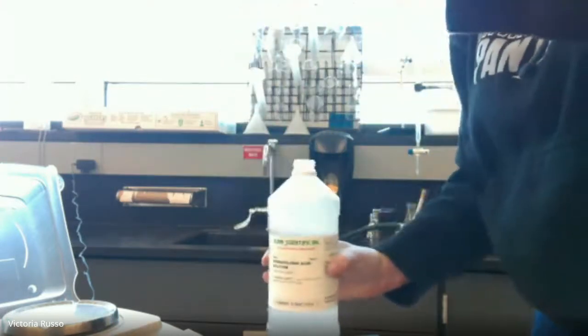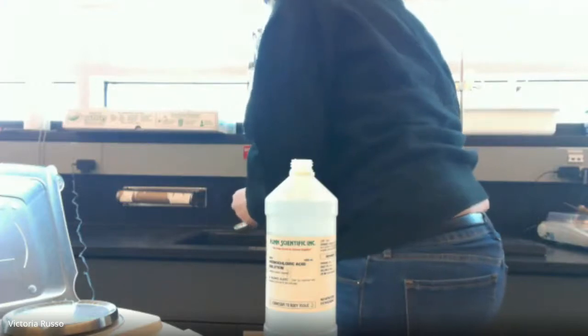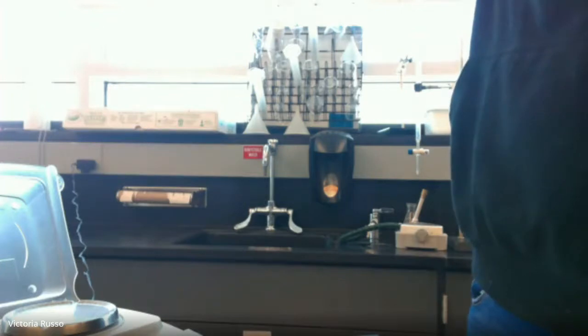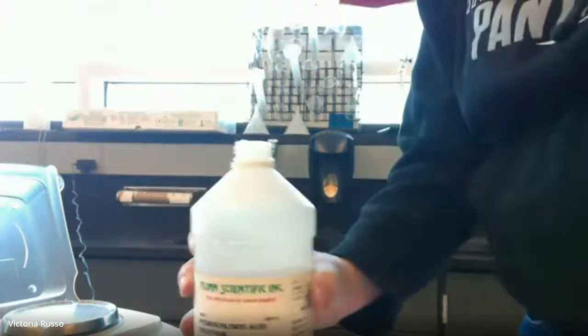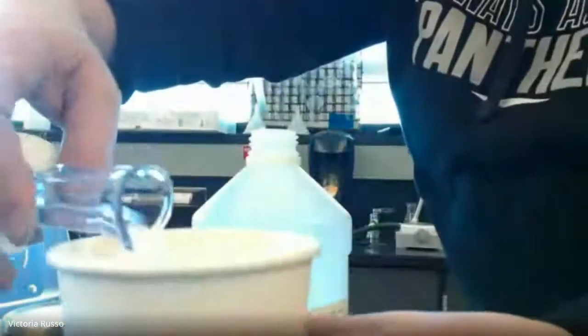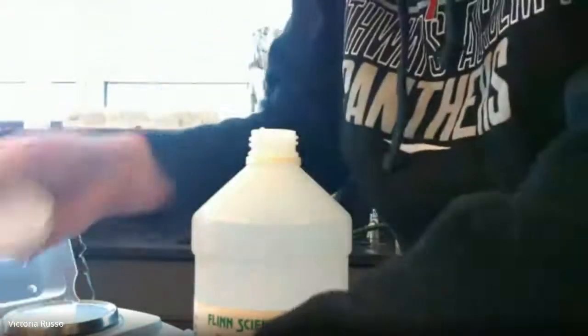I am going to pour the hydrochloric acid, and looking at the meniscus, I'm measuring the acid to the 40 milliliter mark. I need to pour a little bit out, so let me go to the sink. And then you add a little bit more. We're at like a drop. All right. So I am going to pour this into the calorimeter, as I'm doing right here, pouring the acid into the calorimeter. And I'm going to place the top back on, and I'm going to reweigh it.